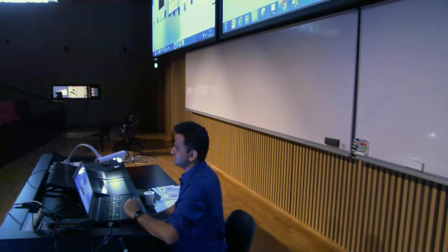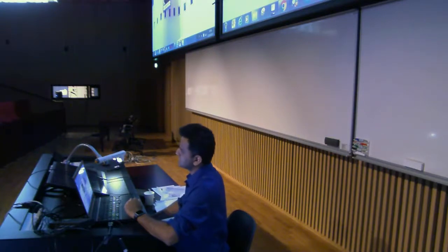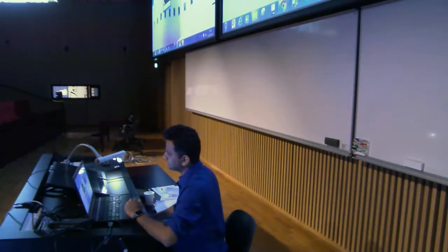Now you see here that there are 2 channels, 5 slices, 51 frames. Now you can see that this is called a stack because there is only one slide bar. But it includes all the Z stacks, all the channels and all the time frames.